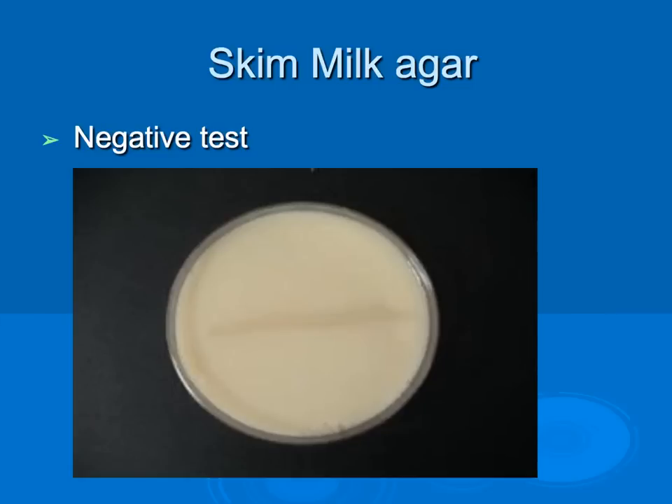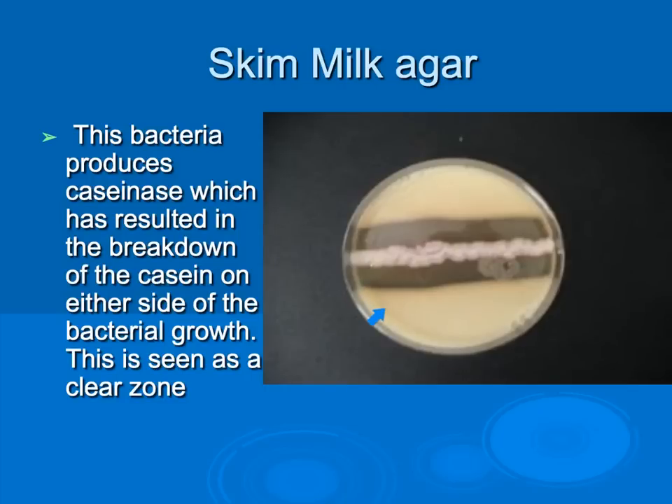Skim milk agar is used to detect the presence of caseinase, an enzyme that catalyzes the breakdown of casein into individual amino acids. A negative skim milk agar test shows no breakdown. Where the bacteria has produced caseinase, a clear zone appears on either side of the bacterial growth indicating breakdown of casein — this is a positive test for caseinase on skim milk agar.